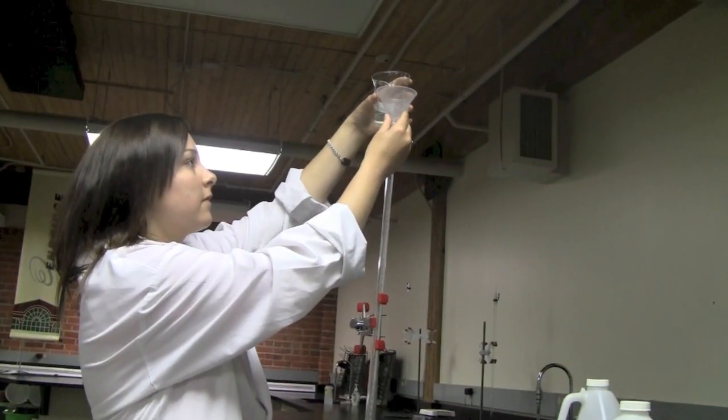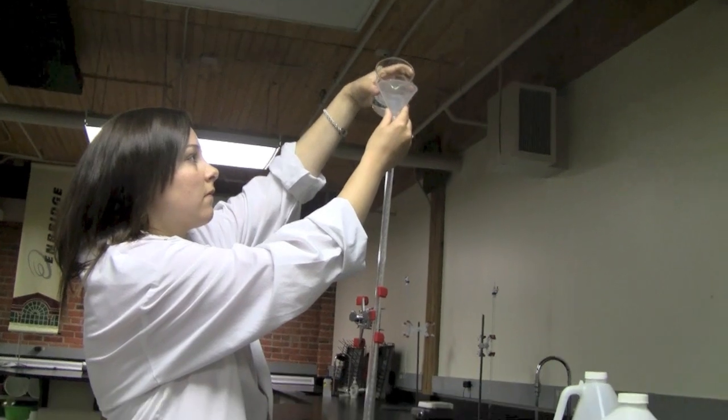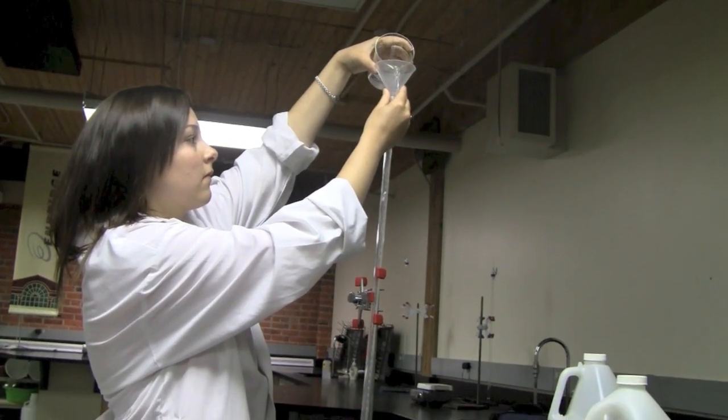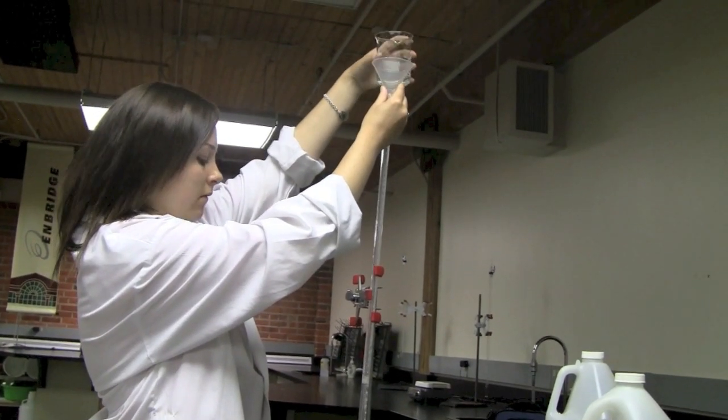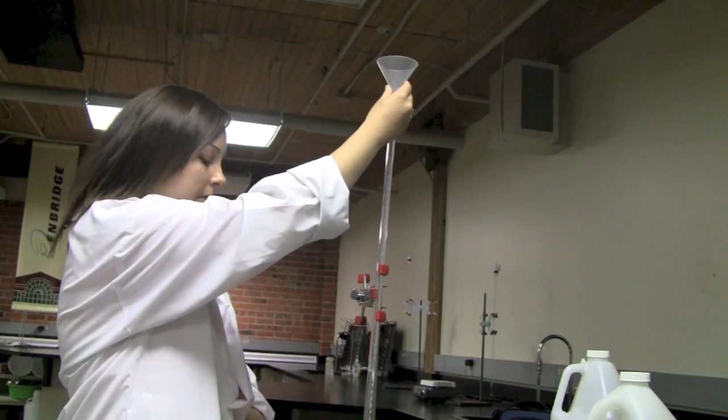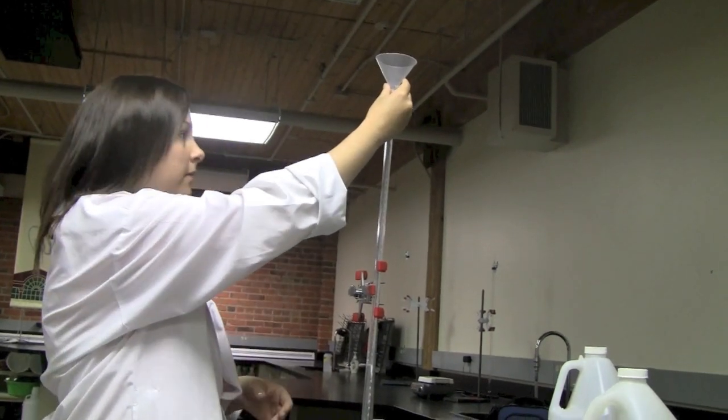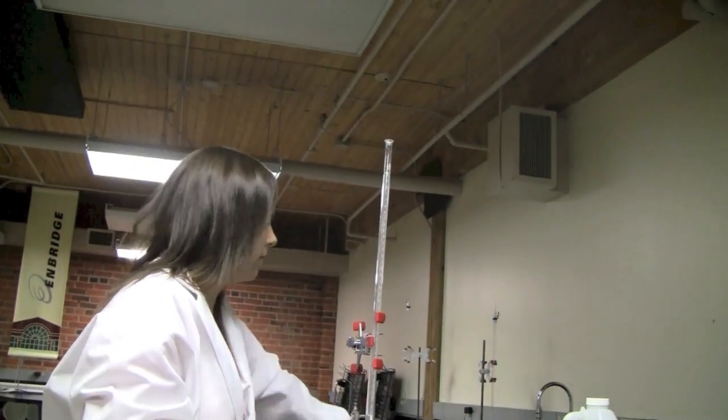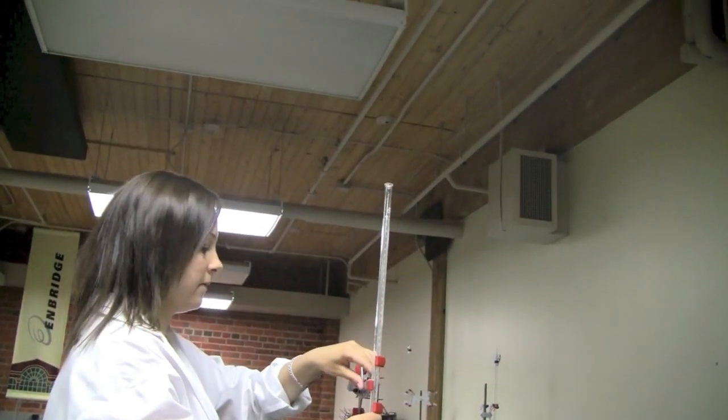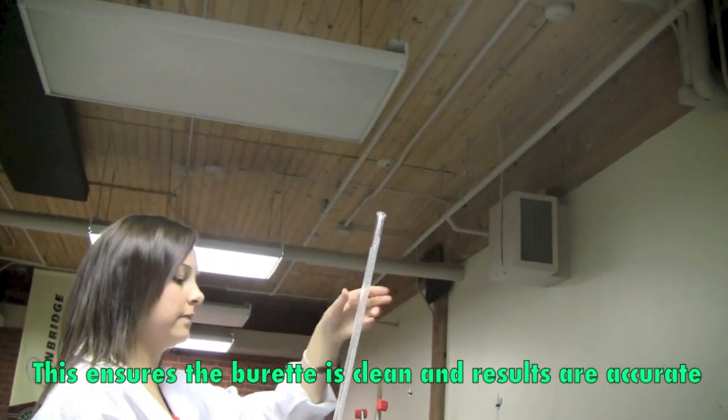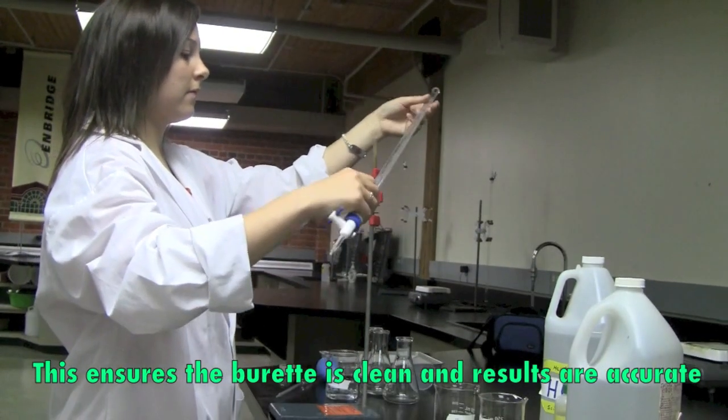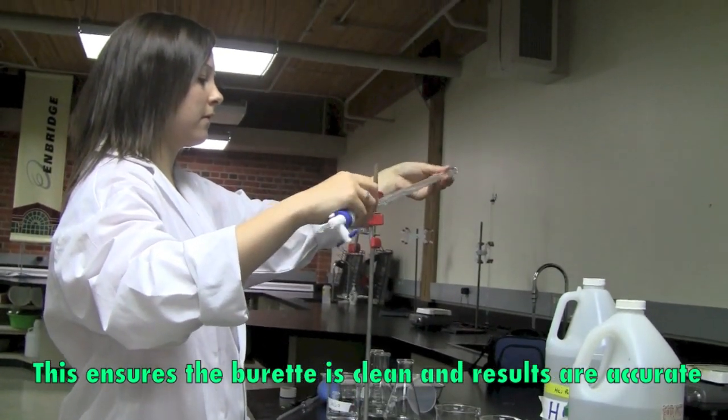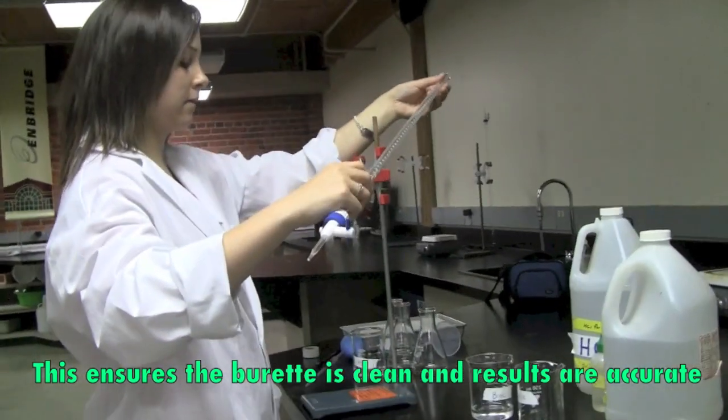Pour in just a very little amount, again, make sure your burette is closed. Take the funnel out and you're going to swirl the burette for a little bit, kind of rinsing it here and there. And you can actually just dump it down and drain it into the sink.